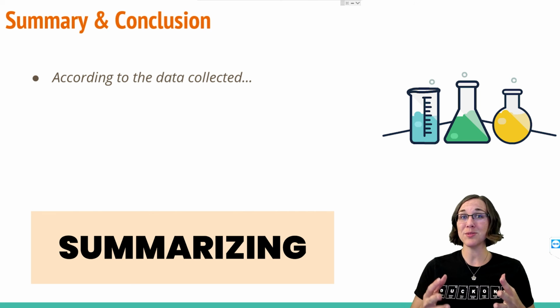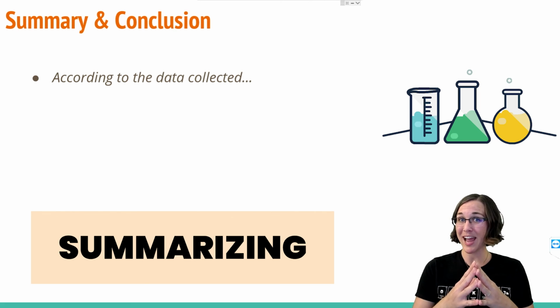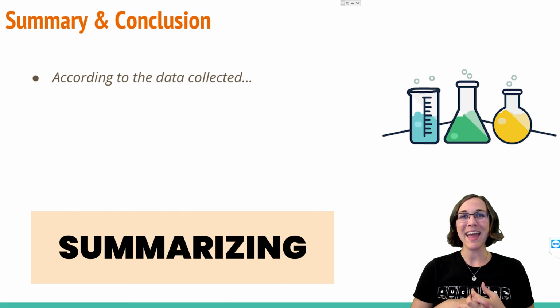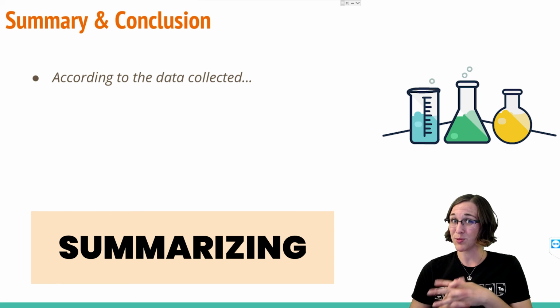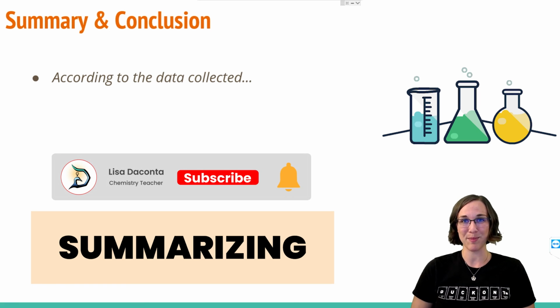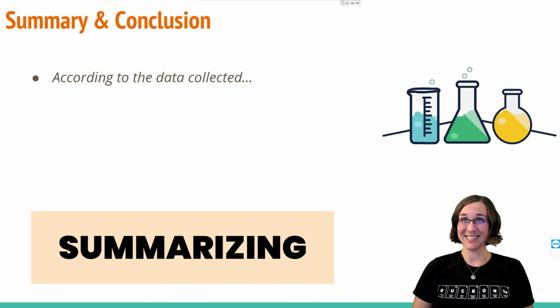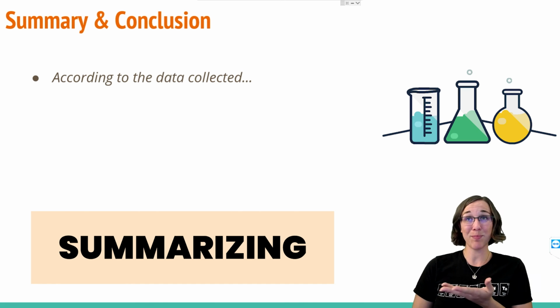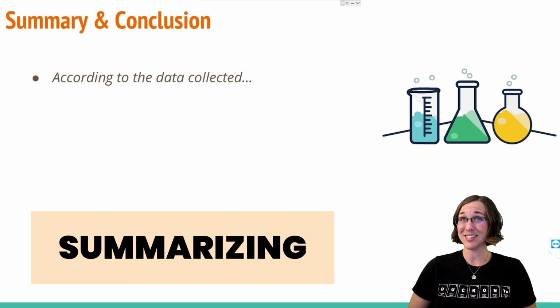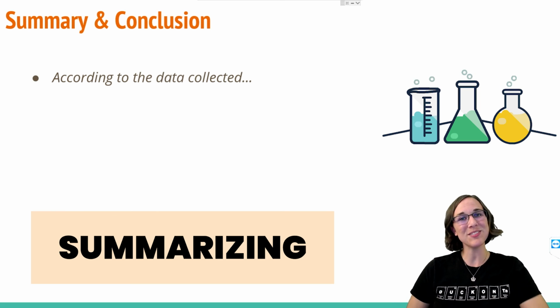From there, we were able to do some dimensional analysis, magical line to freedom calculations, to determine the limiting reactant between the reactants we used experimentally and figure out how many grams of hydrogen gas we collected versus how much could have theoretically been made, to solve for the percent yield of this experiment, which we found to be loaded with error at 241.07%. Yikes. And then we also saw how decreasing the temperature in the room after we collected the gas in the cylinder would have also skewed our data because it would have showed up as about 5.6 milliliters less. Hopefully you now understand how to collect a gas experimentally and then also use the gas law equations to do some experimental calculations thereon.